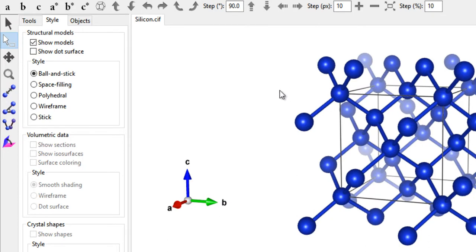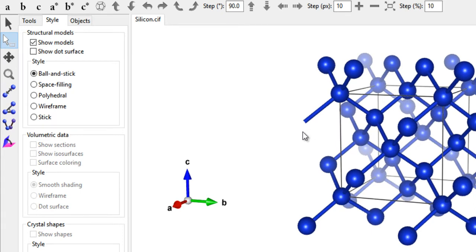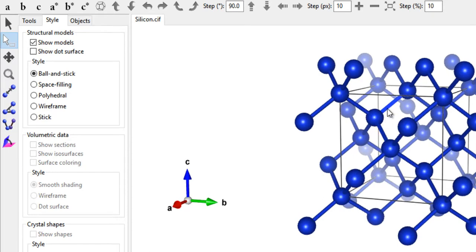On the left toolbar, clicking the selection tool puts you in selection mode where you can click on a particular atom to select it. You can then press Delete to remove that atom, or press Ctrl+Z to undo the action. You can also select a bond and delete it. This is a useful mode for editing your structure.